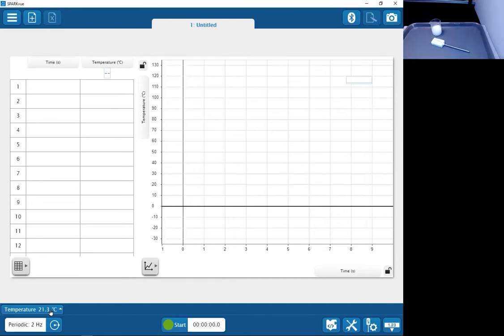So let me put some hot water, rather hot coffee into that beaker. And I'm going to put about 150 milliliters of quite hot coffee. A bit more, and put that back on screen and put the temperature sensor in so that we can make sure we're measuring the temperature of that coffee. All right, so there's 150 milliliters of coffee.